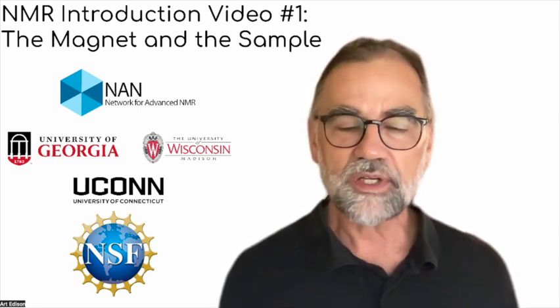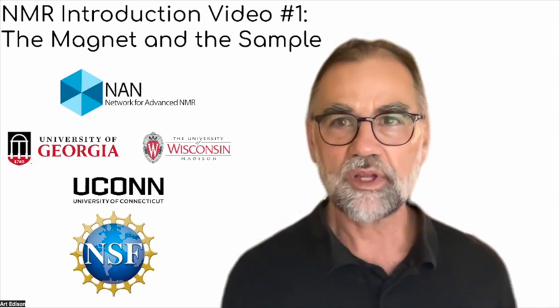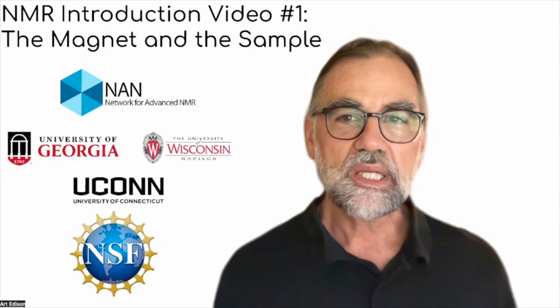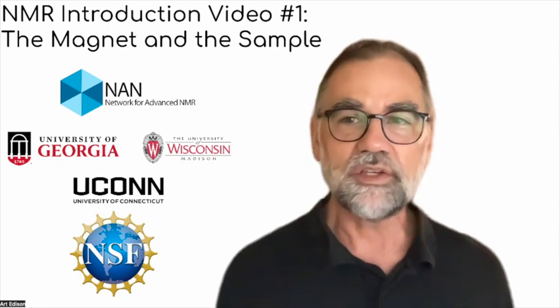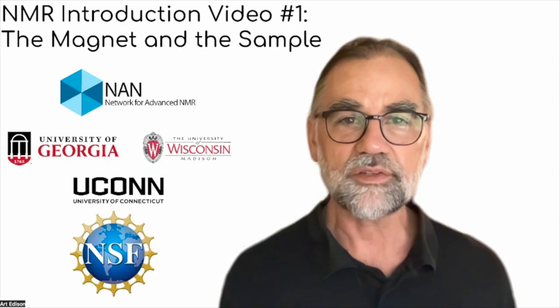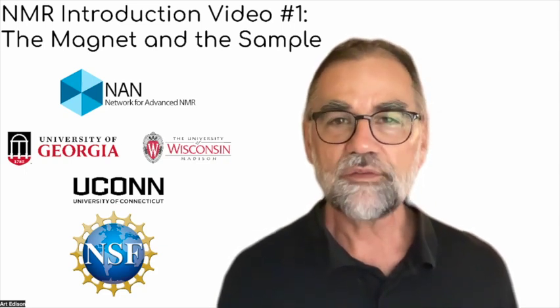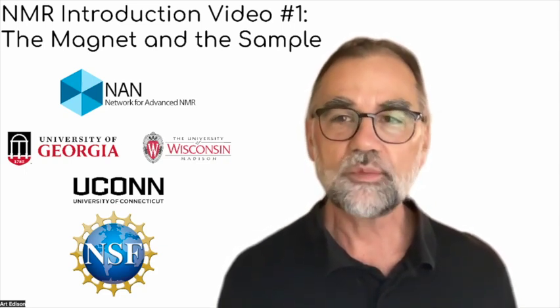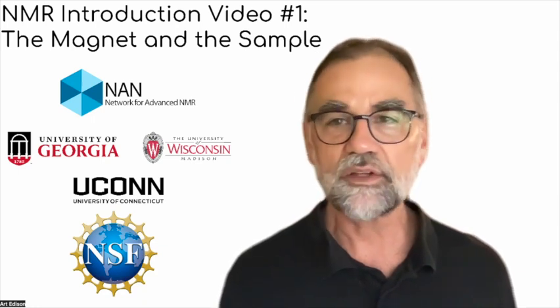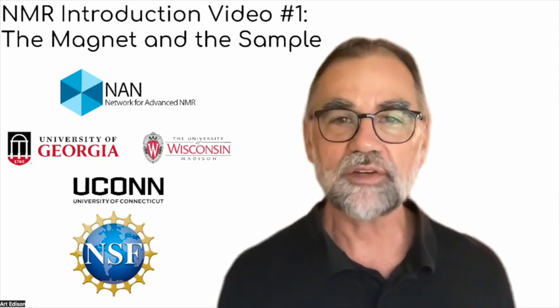I've been frustrated by the lack of material in this area that is dedicated to non-experts so that they can understand the basics and use this powerful technology to solve biological applications. It is true that if you want to develop new NMR methods, you really do need advanced training in topics like quantum mechanics, physics, analytical chemistry, programming, et cetera, et cetera.